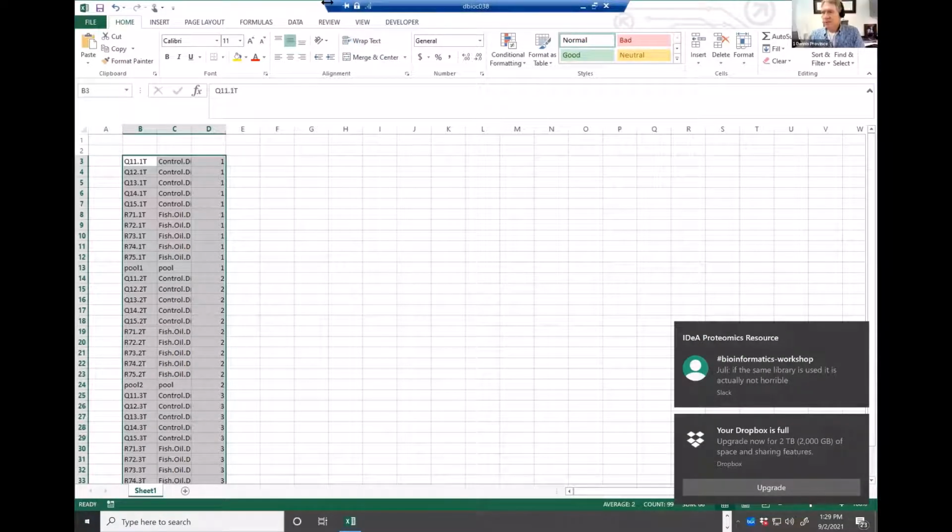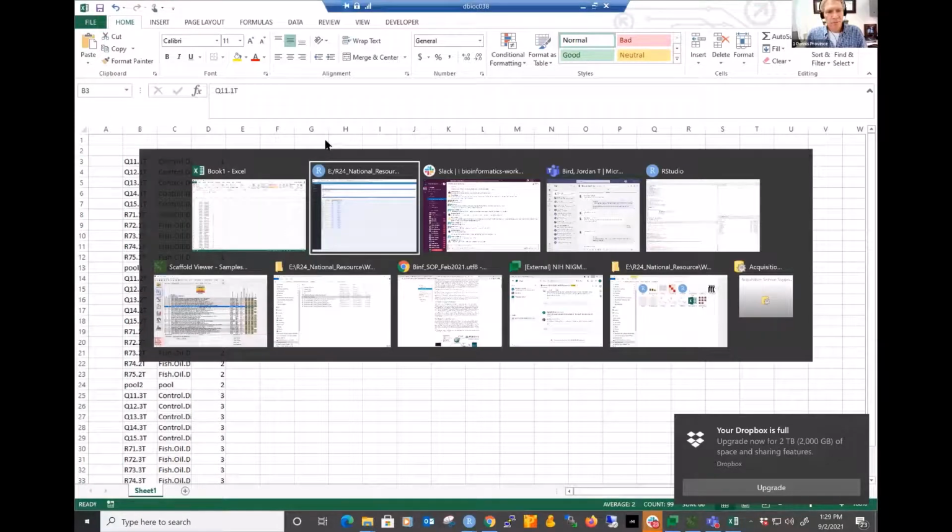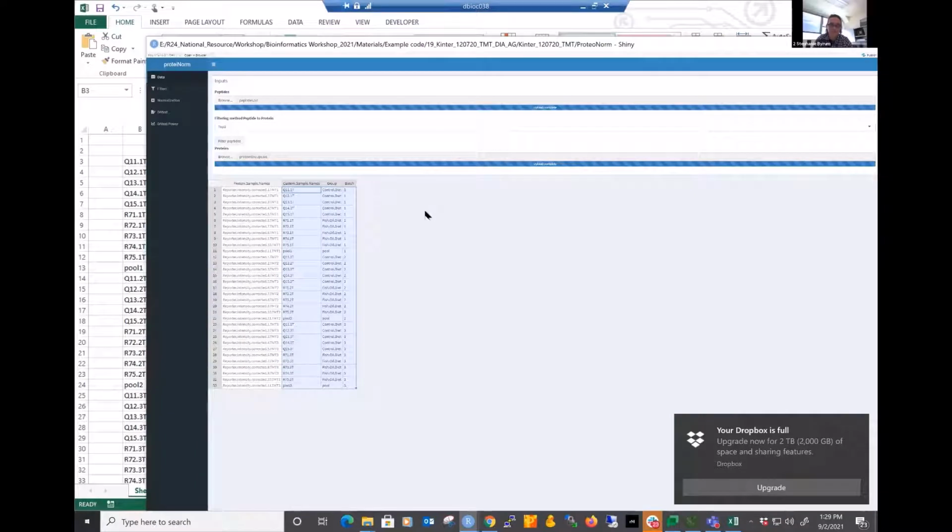The questions that have been coming up are about quantification in DIA and how that's done, and that's what people are talking about. Yeah, Aaron's doing a good job of answering that, and so is Julie. Good deal. That's what I've got y'all here for. That's right.